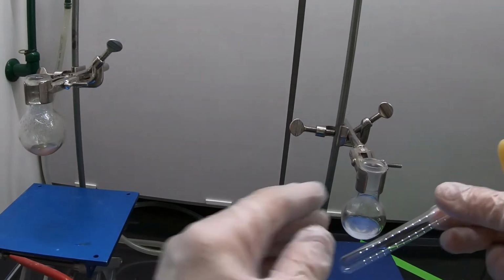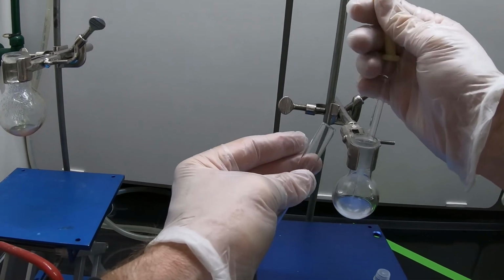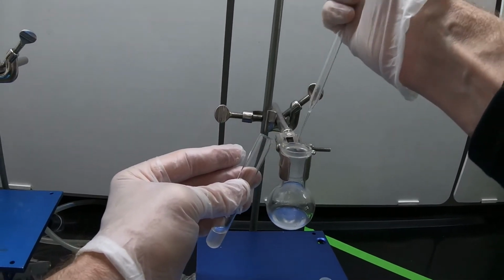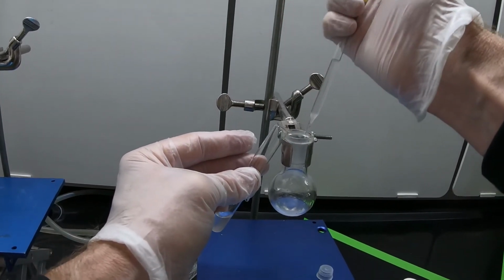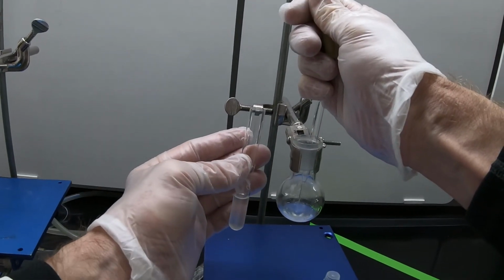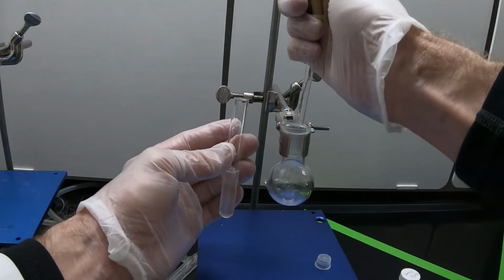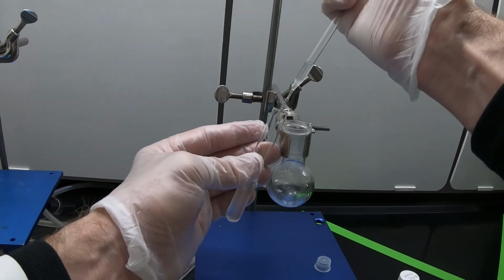All right, so I have a clean test tube, and I will transfer the liquid using the pipette. And again, maybe now you can see the murkiness that's present. Again, yield is not important in this lab. What we are looking for is the ratio of the various products. Using the GC mass spec, we'll be able to identify relative amounts as well as the identity of the molecules using the search library. So hopefully we'll see 3, 4, maybe even 5 different products.